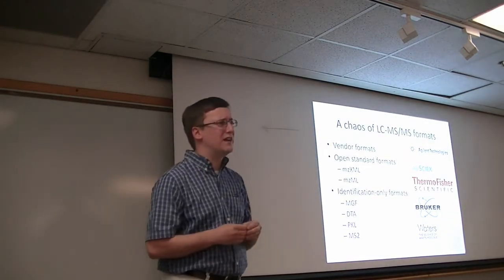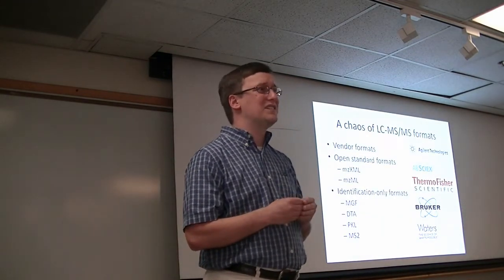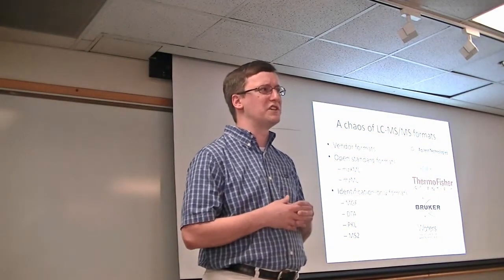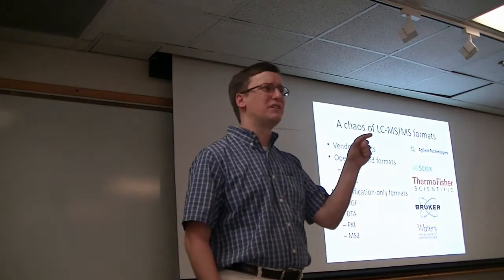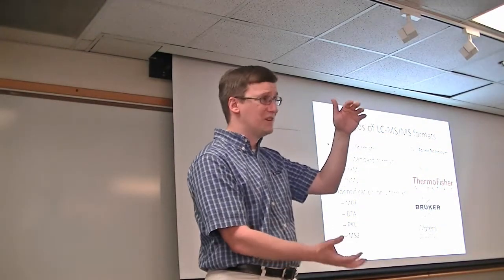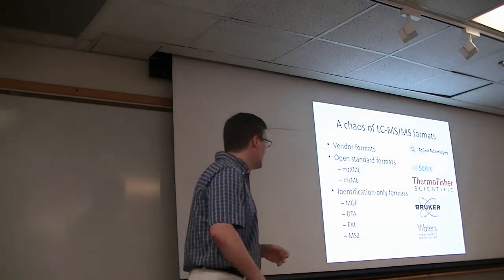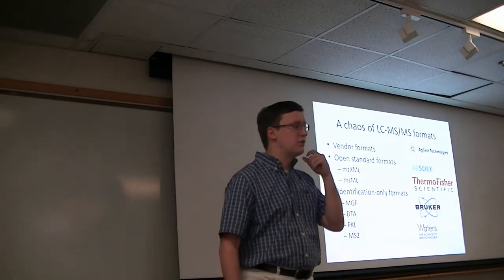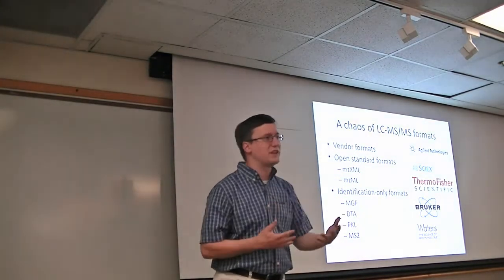The DTA format is one that's been around with us since like 1994, and it's a kind of ancient, archaic way to write spectra at this point. Essentially, each tandem mass spectrum gets written as a separate text file on your hard drive. So you just litter your hard drive with 10,000 1K text files. It's not a very good way to keep your computer happy with you. And PKL was a similar format derived for support of the Spectrum Mill framework for identification. And MS2 was another format that came out of the Yates Lab.